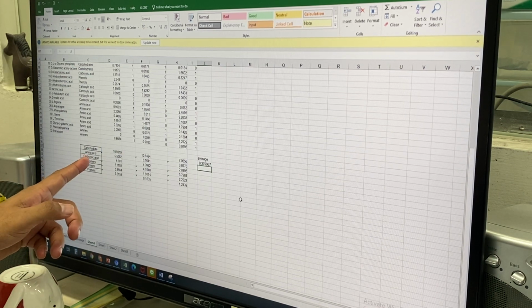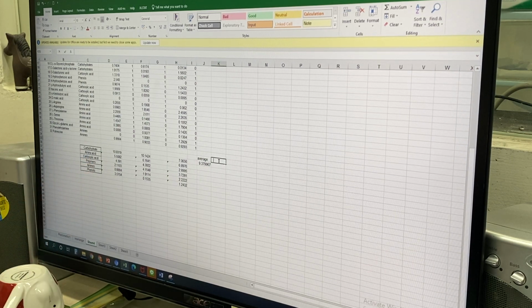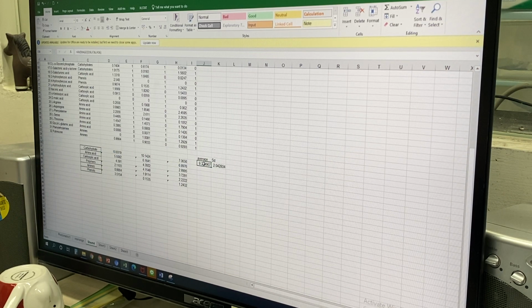So for carbohydrate you put the mean value, okay, and standard deviation STD, okay, STDV, this one, right? Okay. Do you understand? Yes. Just standard deviation, okay? And you don't need to do anything, just drag it.